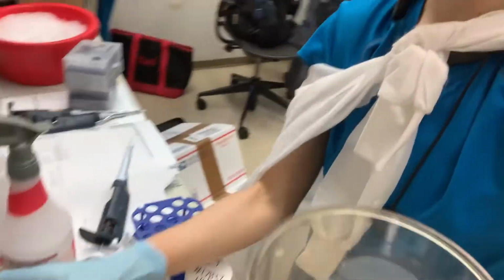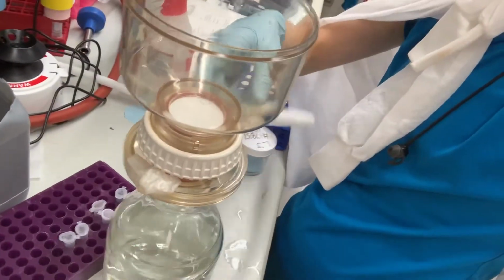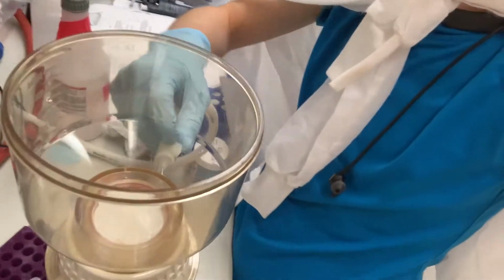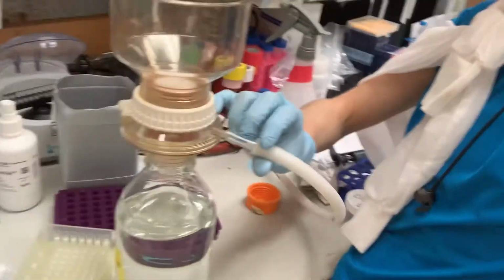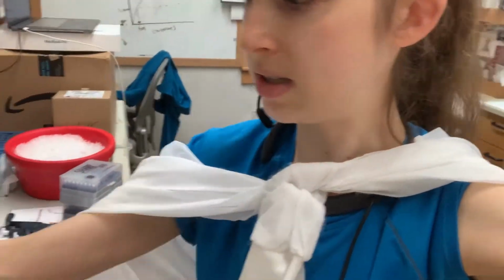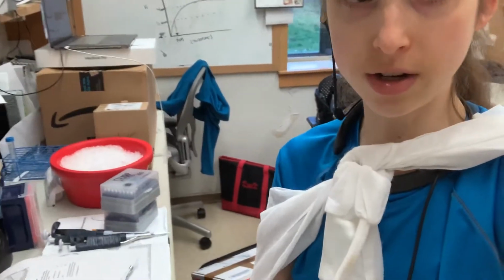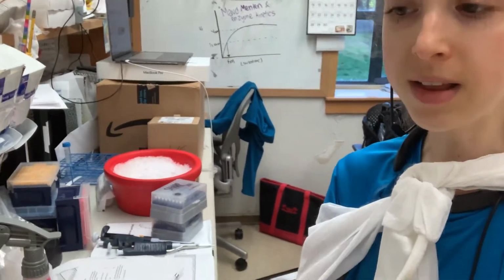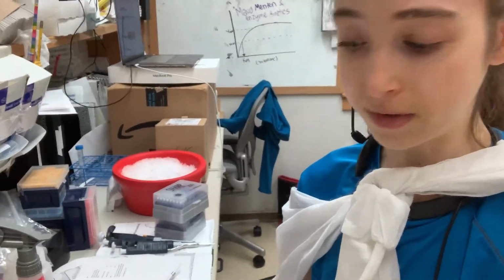Okay. So now this whole thing is tight. Then I can hook it up to the vacuum line. See, I already filtered this morning, so that's why this is already done. But this goes in here, and then when you turn the vacuum on, you'll hear the noise. And then typically what I do is I pour a little of the liquid in to make sure it goes through nicely, and the vacuum is all good, and then pour it in and filter it completely.